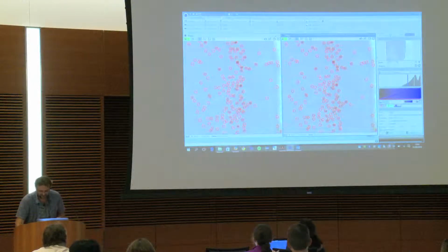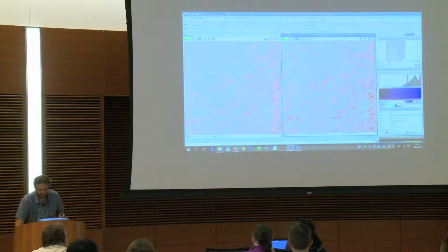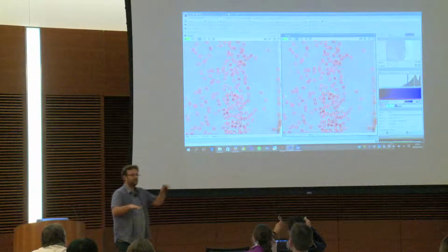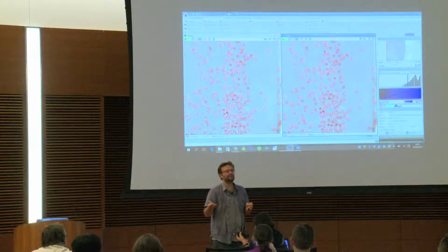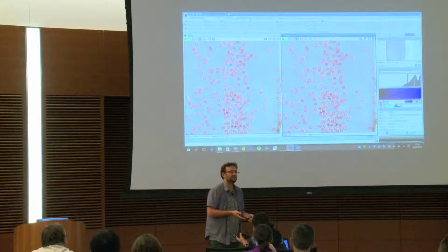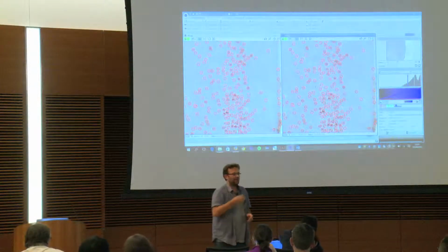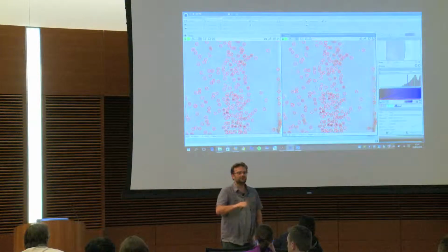And what she was doing is this. Okay, so here I want this one, this one, this one, adding, adding, adding, adding, going here, going around, coming back, and removing what she added. And always trying to have the very best result. Because the problem is that the samples were difficult to produce, so they really wanted to have a very good scoring. And now I explain to these people, this detection here is wrong.